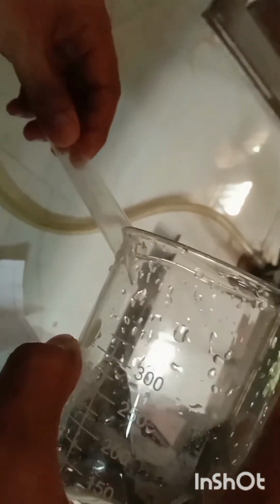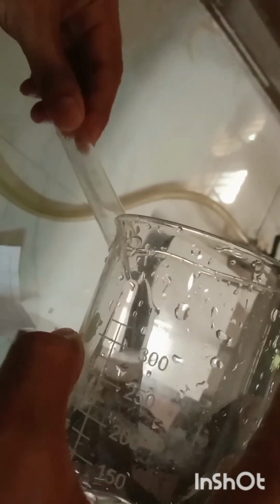In another test tube, we have to add barium chloride solution and dilute HCl. First take it in the beaker and then into the test tube. So if after the addition of this barium chloride and dilute HCl solution in the test tube white precipitate forms, that confirms the presence of sulfate ion. So you can see the white precipitate, that confirms the presence of sulfate ion.